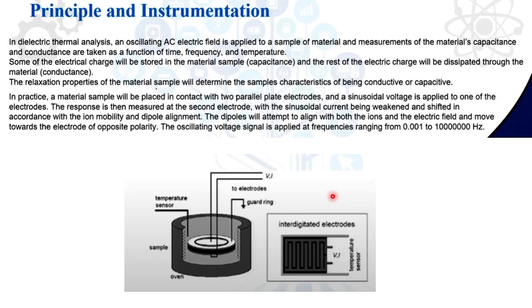Based on that alignment, it will respond, showing how capacitive the material is and how conductive the material is.